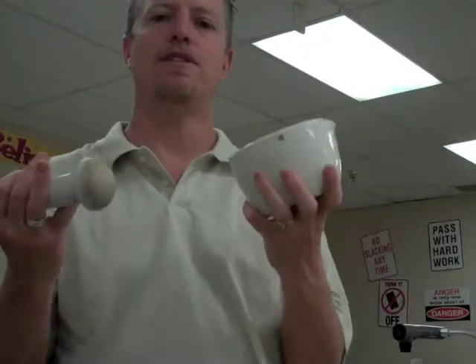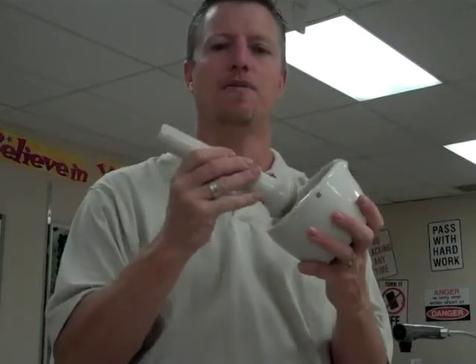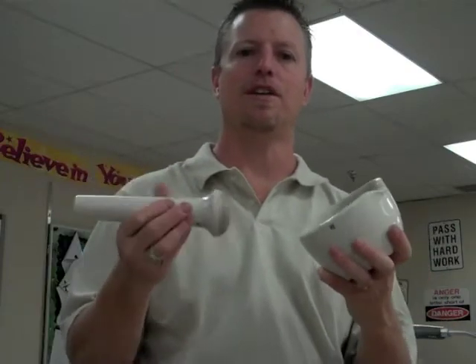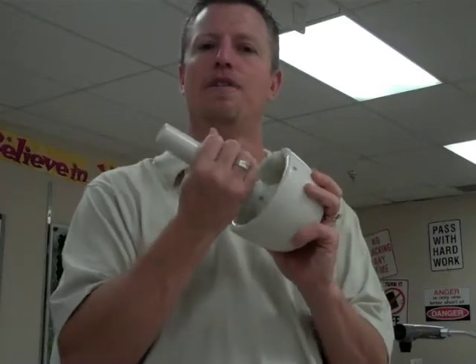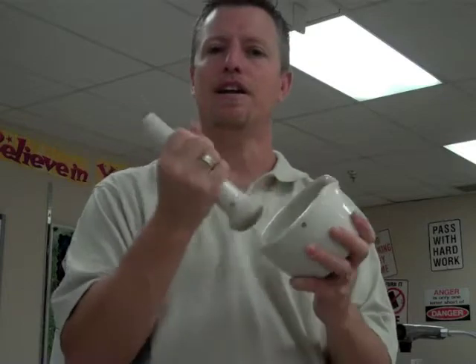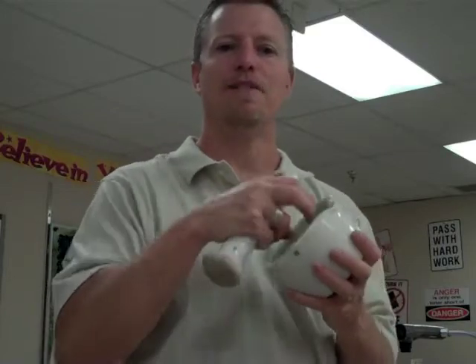You'll see these in pharmacies today for compounding medicines, which means grinding things up. We use this to break up chemicals if they're in big lumps or chunks and get them into a fine powder. Once it's in powder form, it dissolves easier into a liquid. So if we want to make a solution of something like salt water or sugar and we have big crystal chunks, we can break it down to help that process.